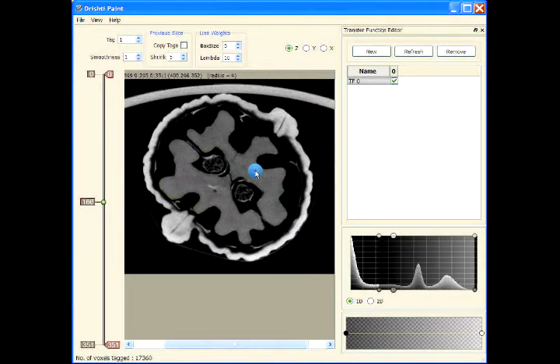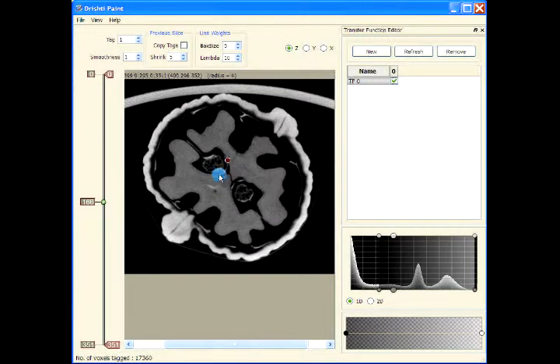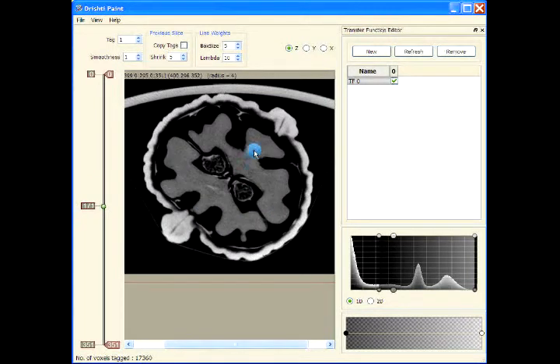And so on. So now we have reset all the tags, so all the tags are 0. Now pressing T every time for every slice becomes a bit boring, and in order to fix that, we can copy the tags from the previous slice, and then we can successively apply the tag operations. So let us first tag this region here.